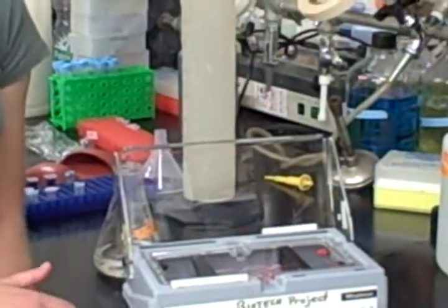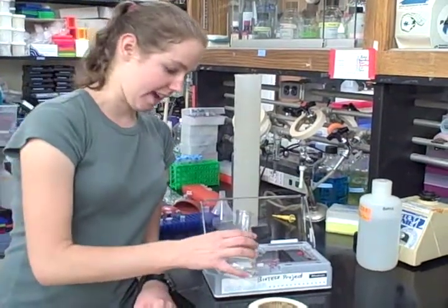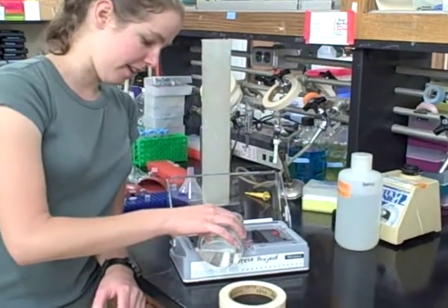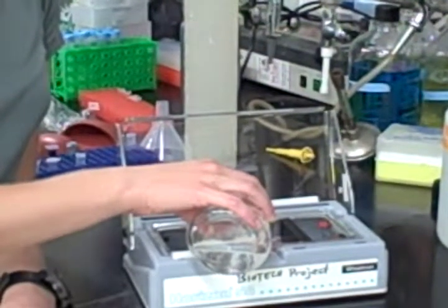Once the cast is closed at either end, you can pour the gel. Take your melted agarose and slowly pour it into the cast. You want to pour about 5 millimeters deep, and make sure that the agarose doesn't go over the edges of the cast.